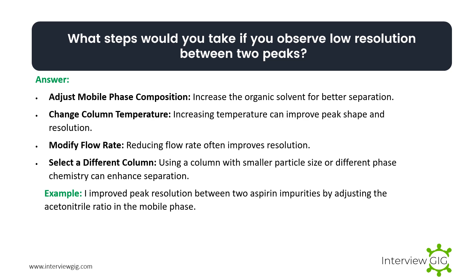What steps would you take if you observe low resolution between two peaks? Adjust mobile phase composition — increase the organic solvent for better separation. Change column temperature — increasing temperature can improve peak shape and resolution. Modify flow rate — reducing flow rate often improves resolution. Select a different column — using a column with smaller particle size or different phase chemistry can enhance separation. Example: I improve peak resolution between two aspirin impurities by adjusting the acetonitrile ratio in the mobile phase.